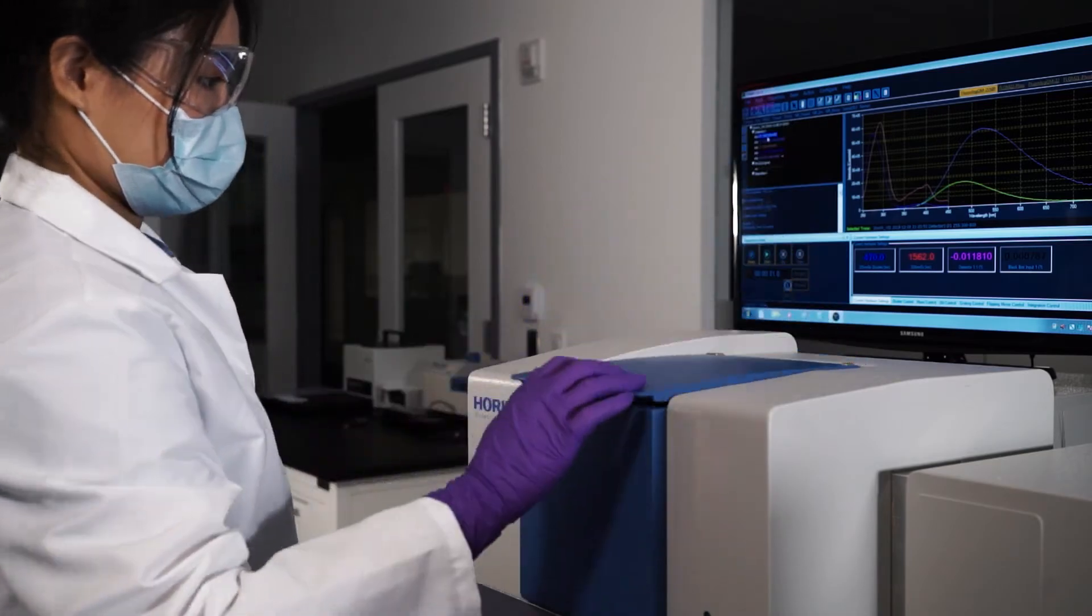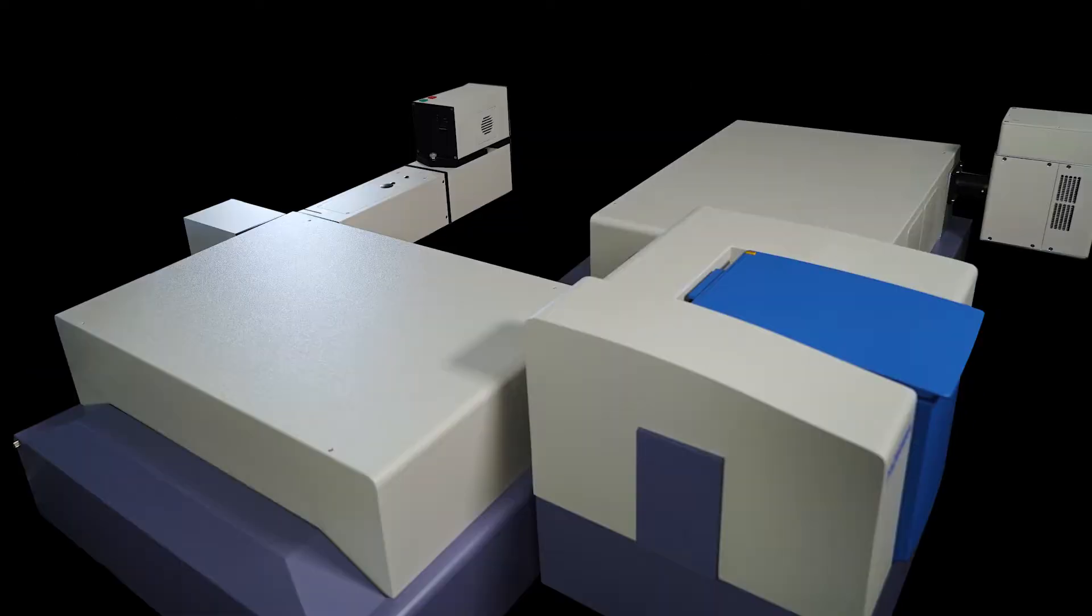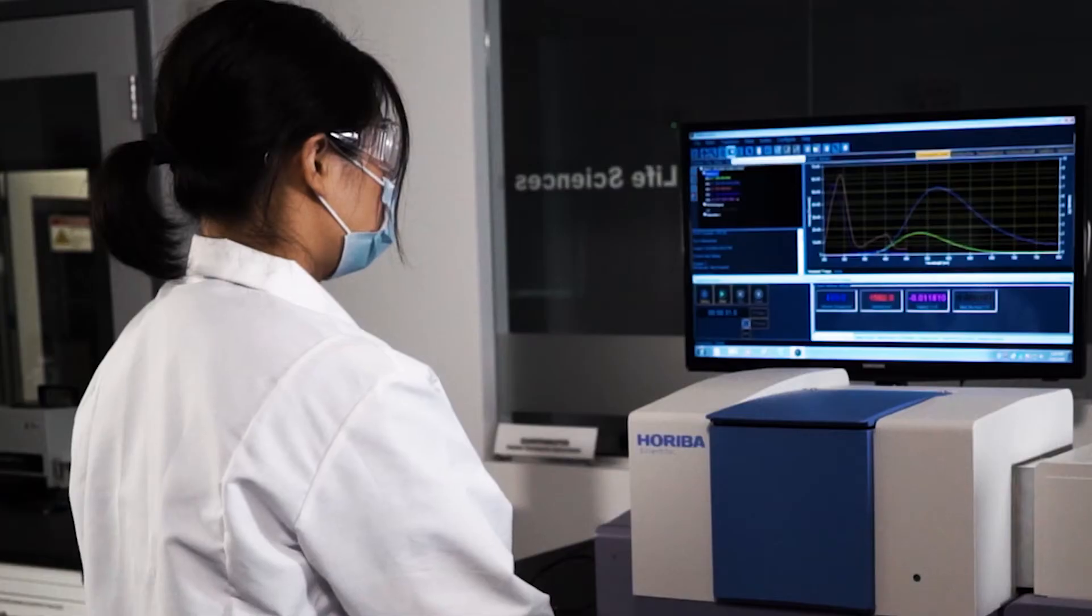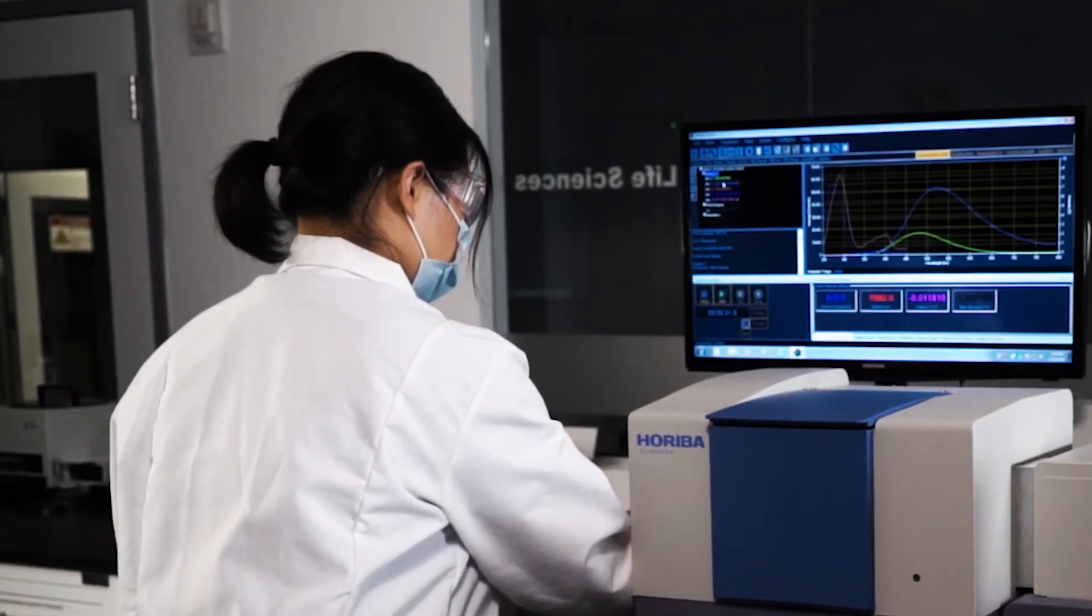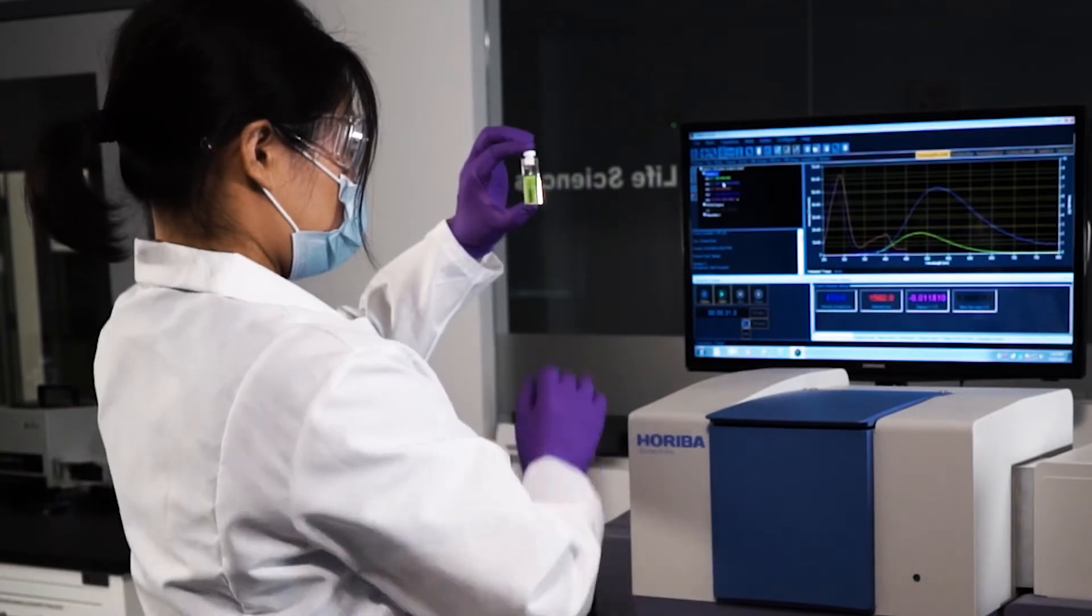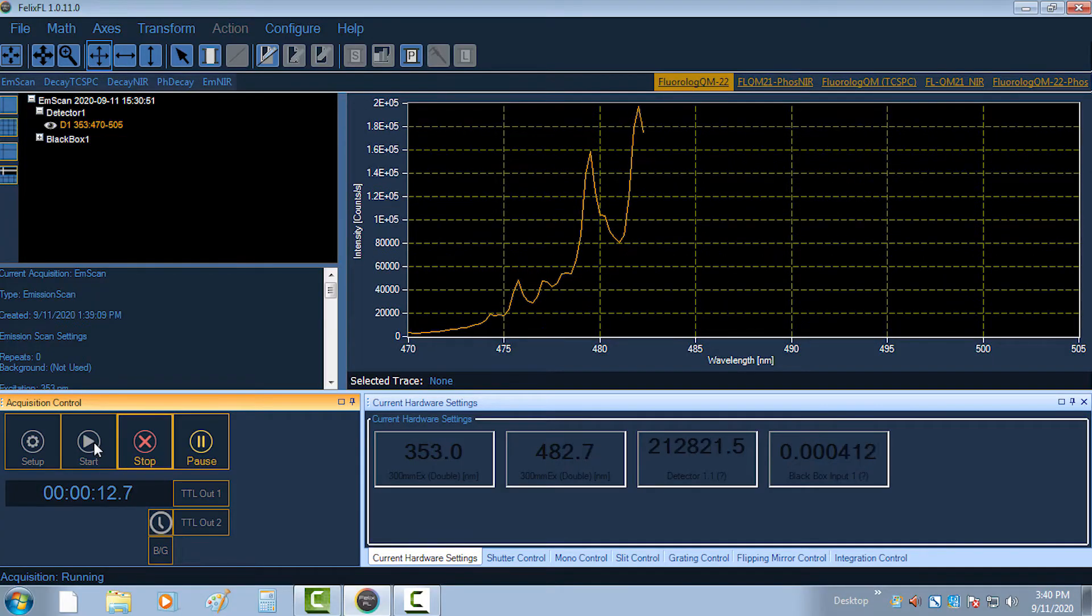The FluoroLog QM can be equipped with single or double monochromators, offering the use of up to six detectors. The standard configuration features a highly sensitive, cooled PMT housing with the ability to operate in four distinct operating modes.